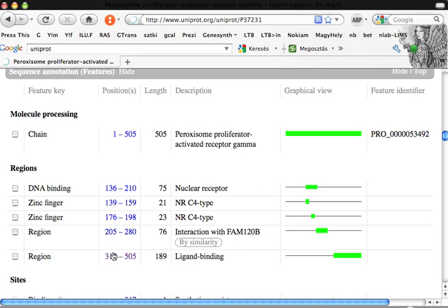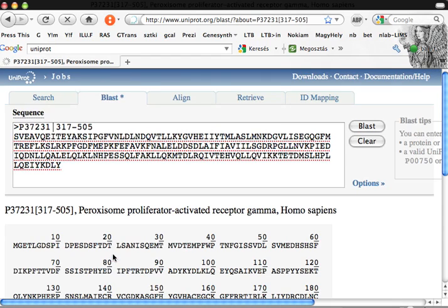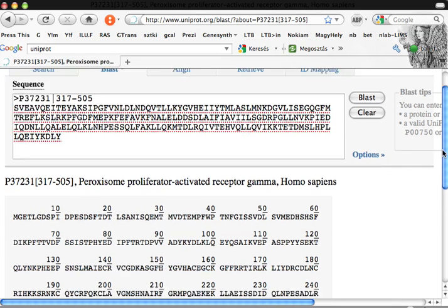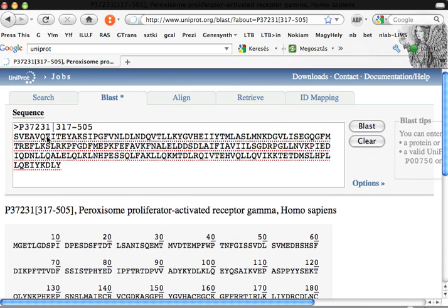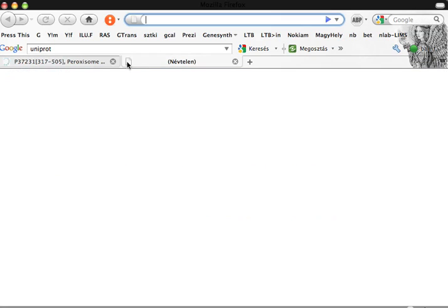Let's go and use the ligand binding domain. Here you see the ligand binding domain. As I told you, the interaction domain ends at 280. So let's use this sequence to design a gene.